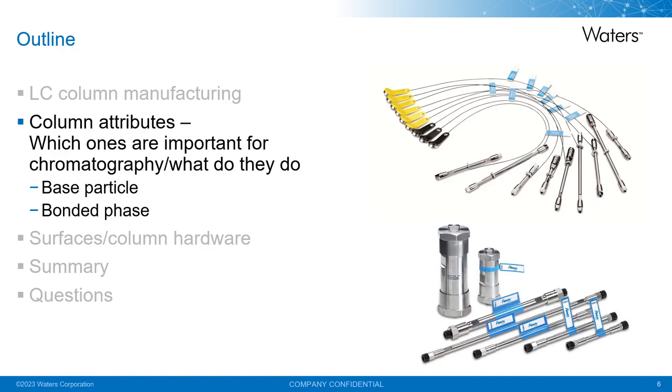In the following slides, I'm going to talk about the attributes of stationary phase, why it's important for chromatography, and what the impact is. I'll focus specifically on the two key parts of the stationary phase, and that's the base particle and the bonded phase.